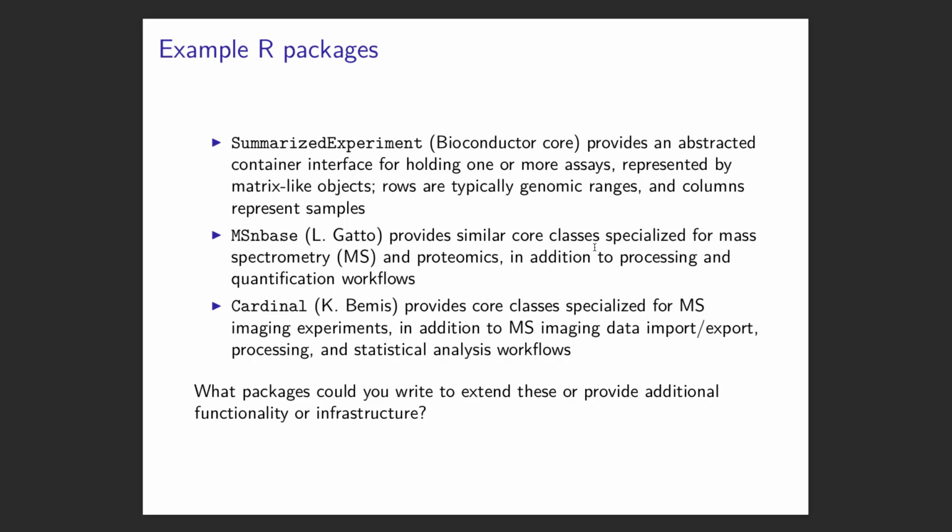That's more specialized for proteomics and mass spectrometry. And Cardinal, which is my package, is doing a similar thing, but with a focus on mass spectrometry imaging. So each of these are different packages that implement some kind of core classes for working with different kinds of data. And the idea is that people can depend on these packages and create new methods building from the classes of these.